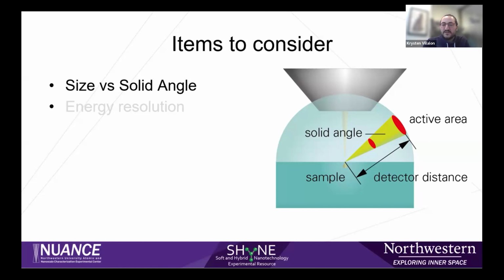All right, ideally you have a large detector that's positioned reasonably close to your sample. So those windowless detectors are great for that because they sit much closer to the sample, maybe closer to where the smaller red circle is instead of back here more. And they've actually got a pretty large detector area. So it really covers a lot of the surface of that sphere and gives you great counts and better resolution overall. So if you ever have a chance to use those windowless detectors, they can give you some pretty serious data. Plus they're great for light element detection as well because they don't have that window.